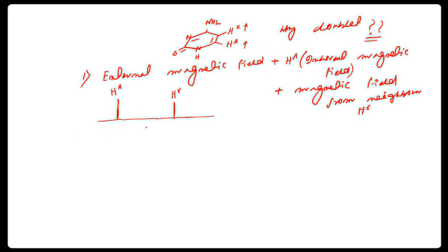If there is no interaction between Ha and Hx, they will be like that. Now we'll consider the interaction.